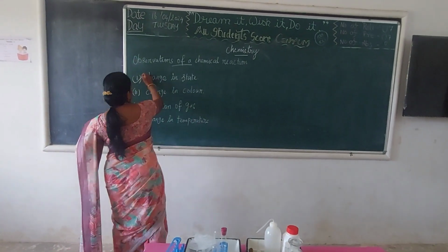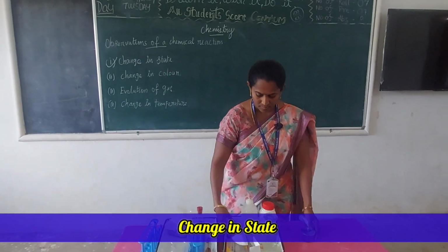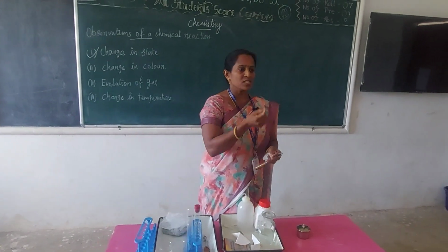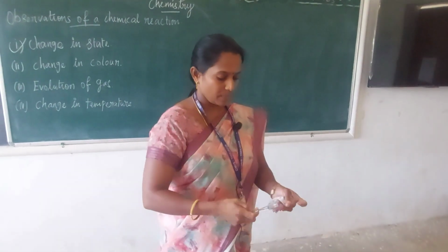First one, change in state. Here I have a piece of magnesium ribbon. It is in solid state. Now I am going to burn this.